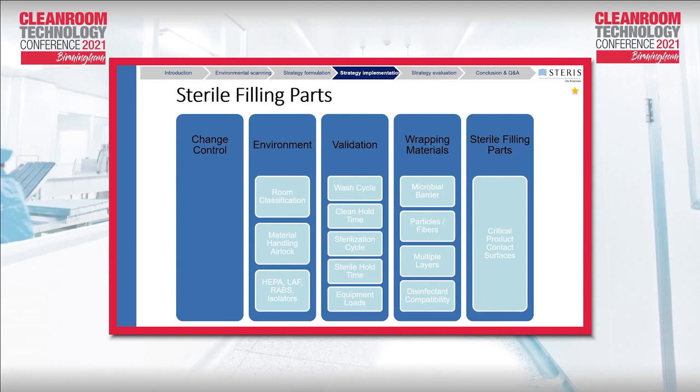But then there is also the wrapping material, which is a barrier for the microbe, but also a barrier for the particles if it's not shedding fiber. But also having multiple layers will allow us to have what we call a continuity grade. That means every step you are removing a layer, and if not possible, then there is an adequate disinfection process, making sure also the disinfectant is compatible with those layers.